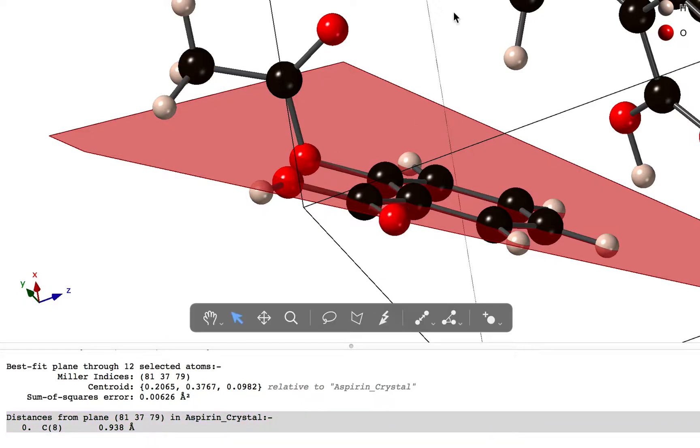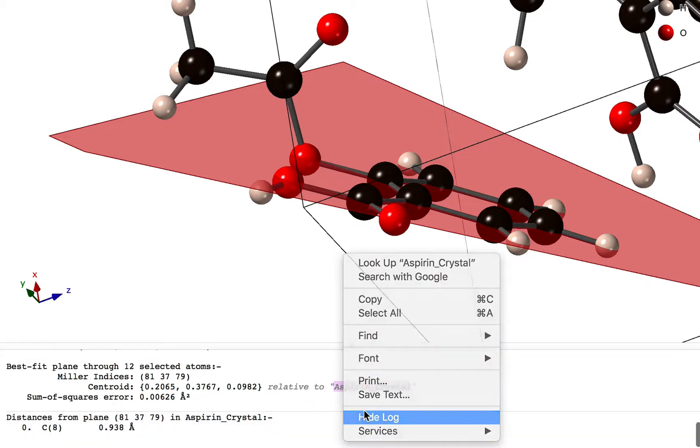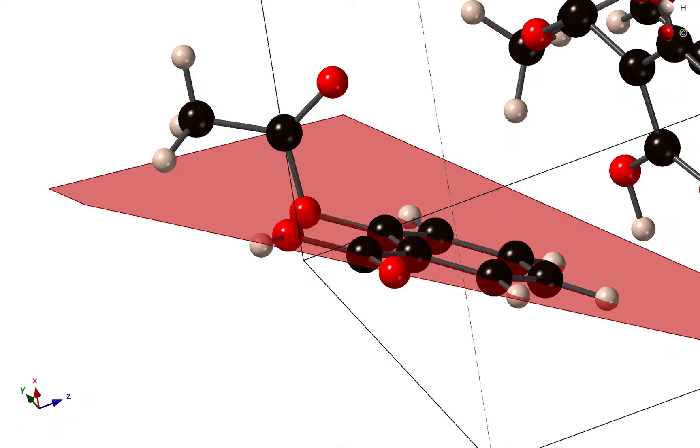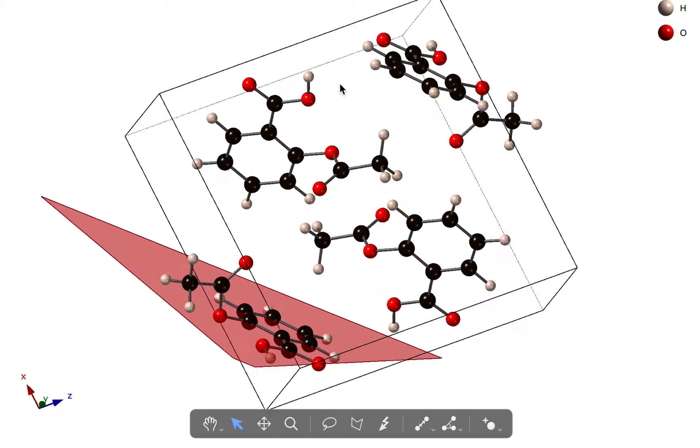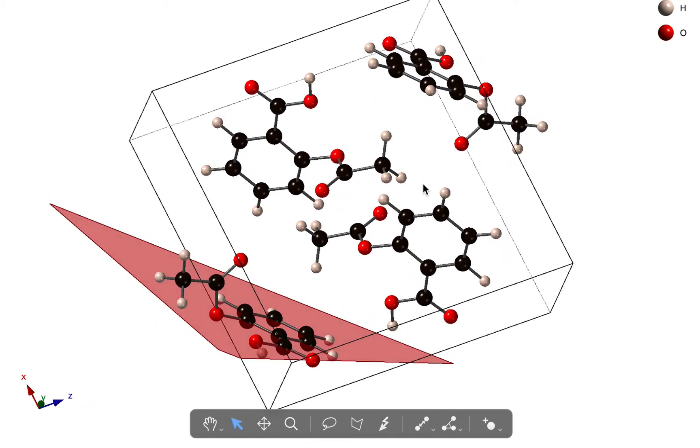So the next thing we might want to do is hide the log for the moment, and we might want to measure the angle between two separate molecules. So let's take the first molecule that had a ring fitted through it. Let's take this molecule over here and we might want to measure the best fit plane through this molecule.